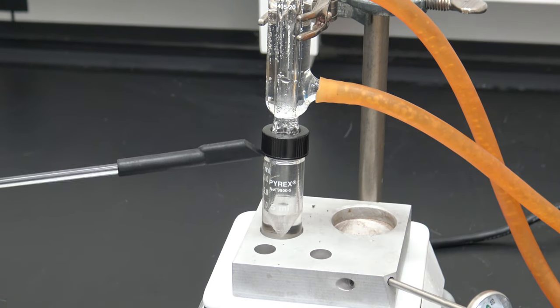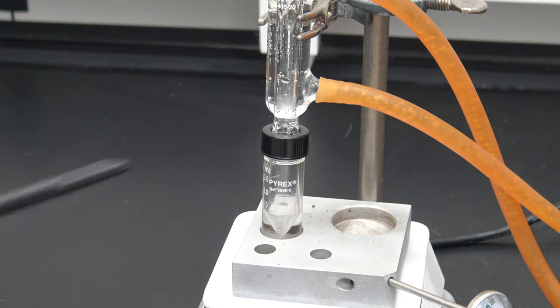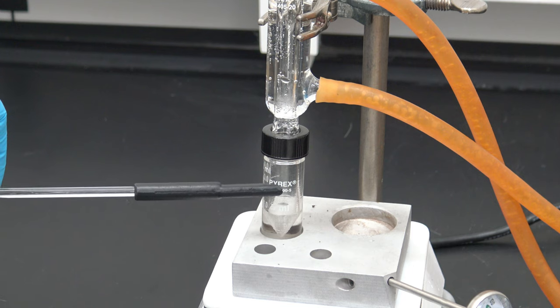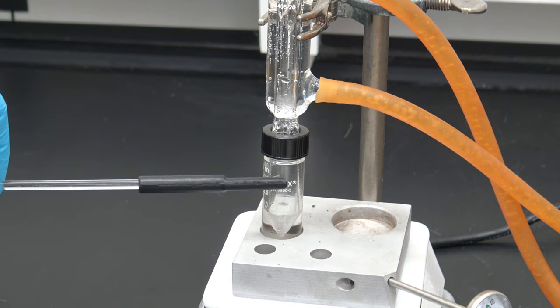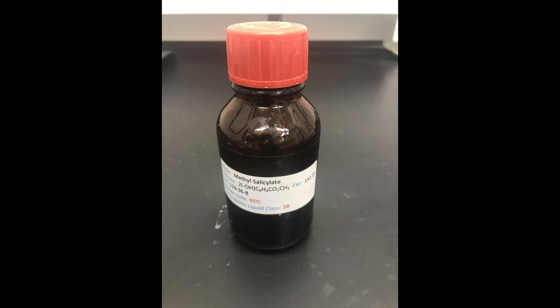I'm now going to remove my reaction vessel and load in my reactants. So I'm going to put in this reaction vessel some methyl salicylate, some sodium hydroxide, and a small boiling chip. This is just an image of the commercial methyl salicylate that we are going to use.